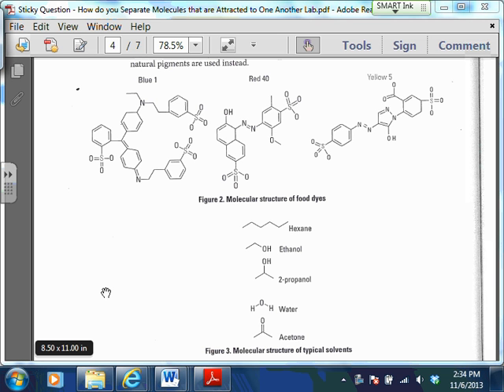All right. Now, most of our post-lab questions are going to focus in on why things happened the way that they did. The issue is you might not have all of the data yet. We're going to get the data tomorrow when everyone comes in, because some groups needed to let their stuff dry before they could make their measurements. So we're going to compare RF values for all the different solvents very quickly at the beginning of class tomorrow, and that should give you the data that you need to confirm what we're talking about right here, okay?